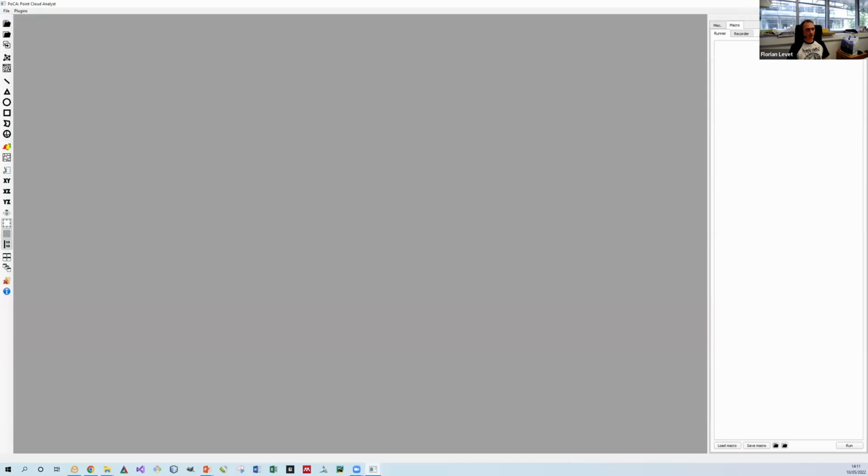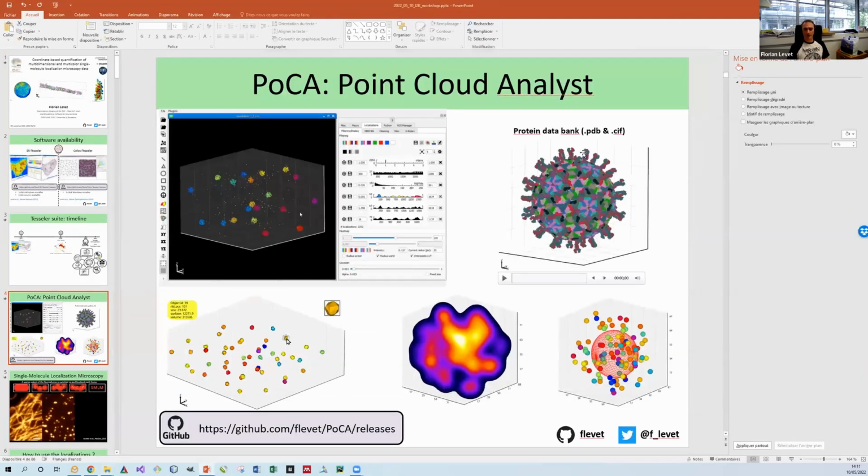For now, I will begin to really go inside my workshop. So I have a workshop that is more like hybrid courses and demo of PoCA. I'm not expecting you to do the same things that I'm doing, because I will need to go quite fast, and it's very difficult on virtual, on remote, to have a proper workshop. So it's more like I will try to teach you how people are quantifying single molecule localization data in the domain, show you how you can do that in PoCA, and then you will be able to test it at home when you want.